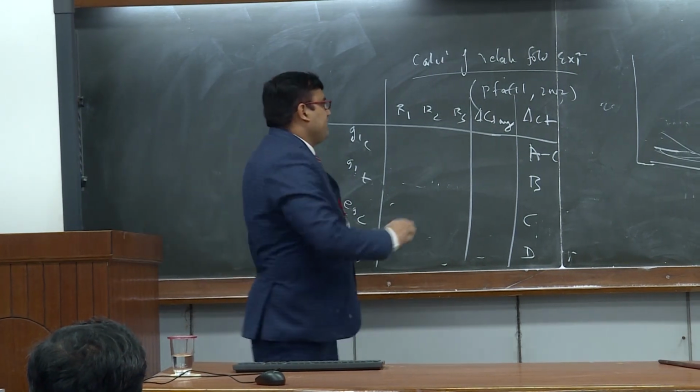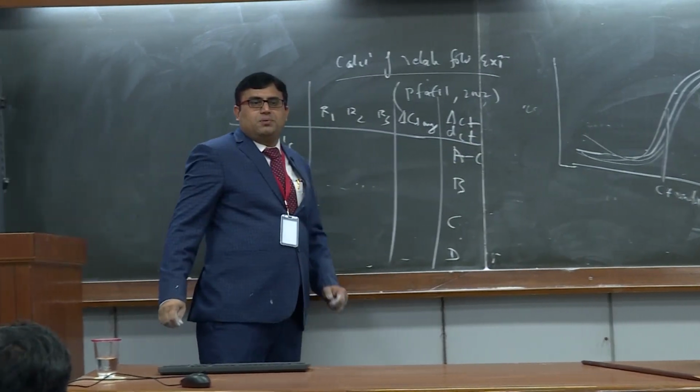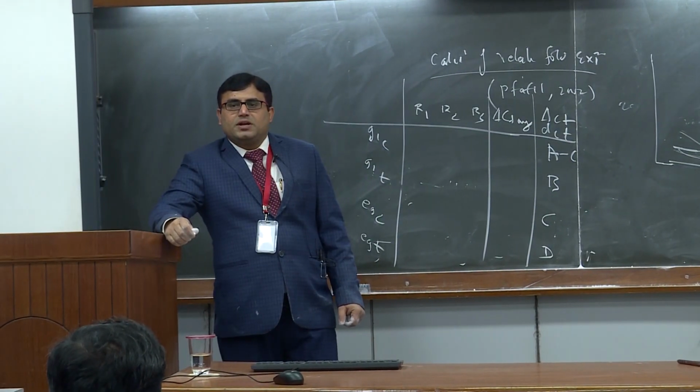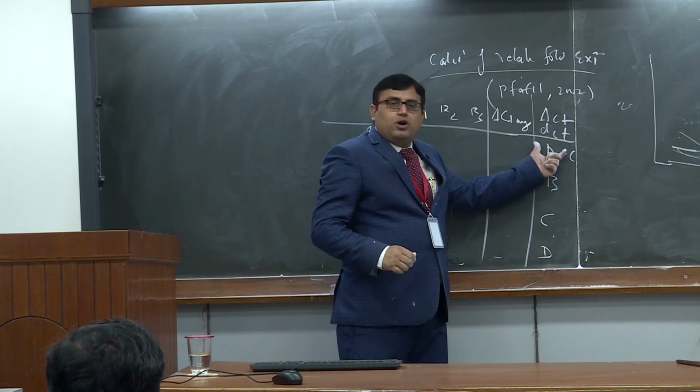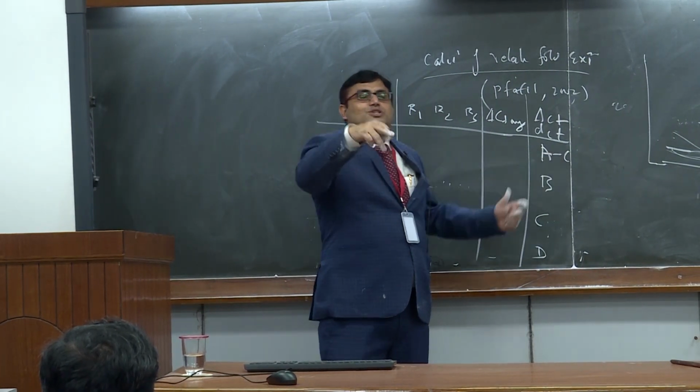It means the CT value of the gene minus the CT value of the same treatment of the endogenous control gene.